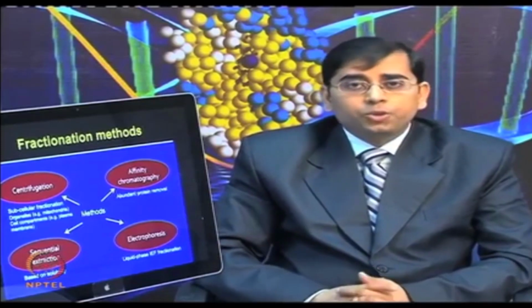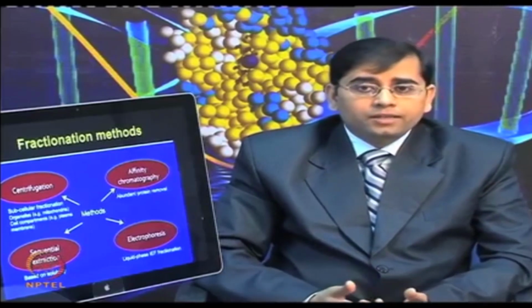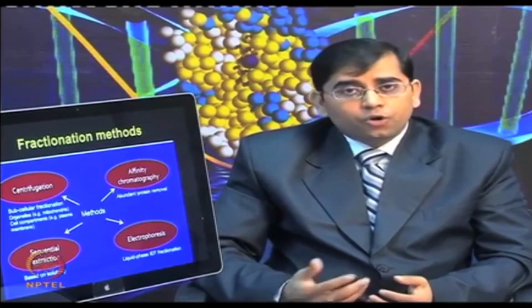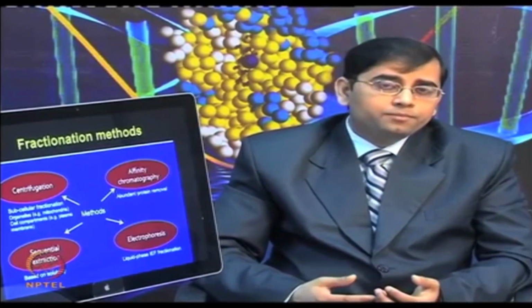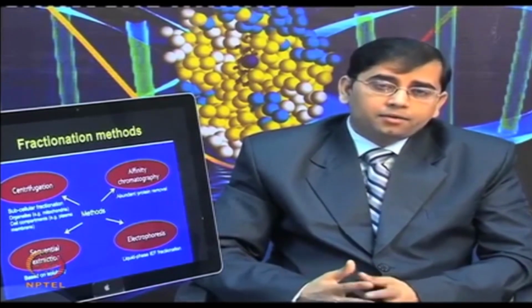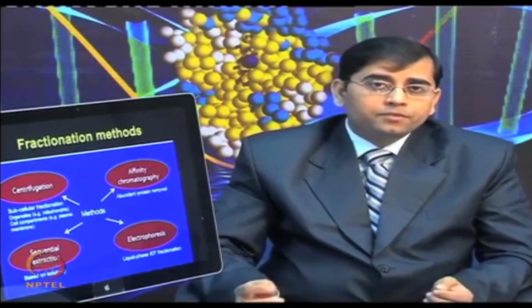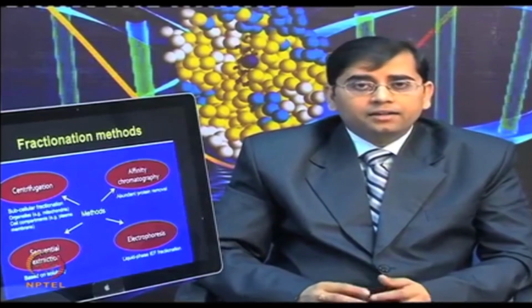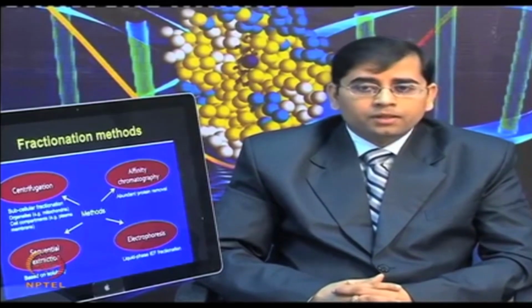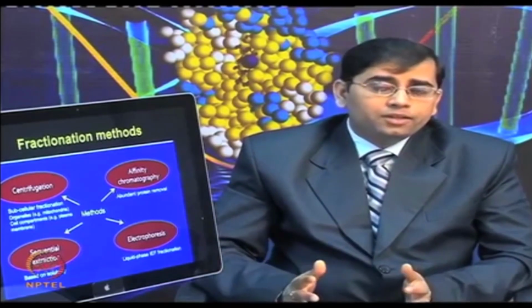Electrophoresis can be used for fractionation. For example, if you are using a gel-free method, where you directly want to extract the protein and analyze it using mass spectrometry, then rather than applying the whole sample directly to liquid chromatography, one can first simplify the proteome using isoelectric focusing, doing the IEF process in the liquid phase itself. Liquid-phase IEF fractionation can simplify the proteome based on the isoelectric point.